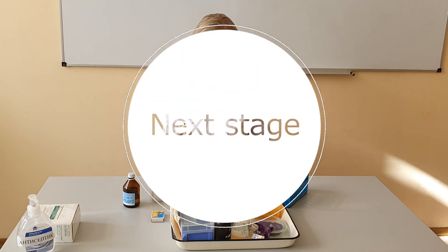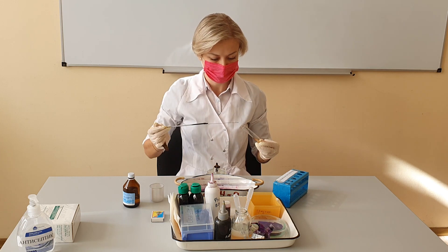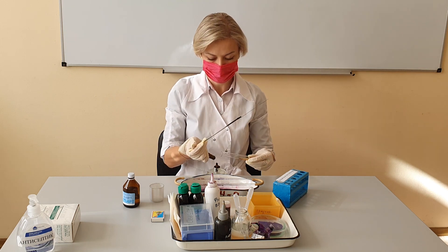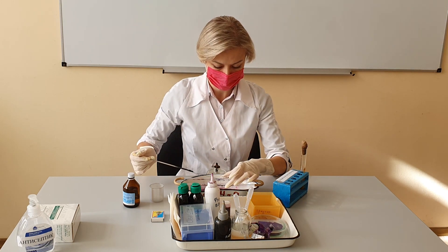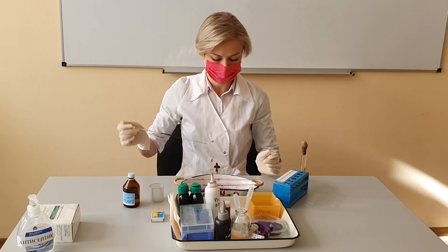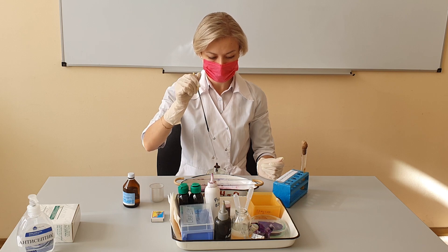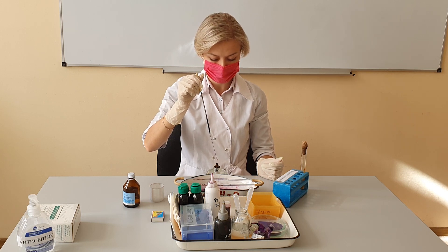My culture is on slant agar in a test tube. We need to take some biomass of the microorganism from the surface of the agar. Use the flat part of the loop to smear the drop around the slide, using a spiraling circular motion to spread out the drop. Don't forget to sterilize the microbiological loop after this procedure. It is important to recognize the side of the glass slide that you put your bacterial sample on.